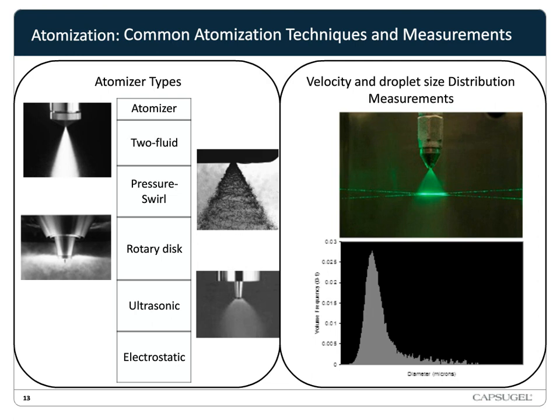What we then do is use a semi-empirical model to relate the droplet attributes to a particle size distribution of the dry powder. When we optimize the SDD particles, we essentially change the particle size and span through atomization, and density and morphology through drying kinetics. So now that we have described the process handles we use to engineer the SDD particles, we'll take a step back and look at some of the other SDD attributes we have to be aware of when we optimize the mechanical properties of the SDD.